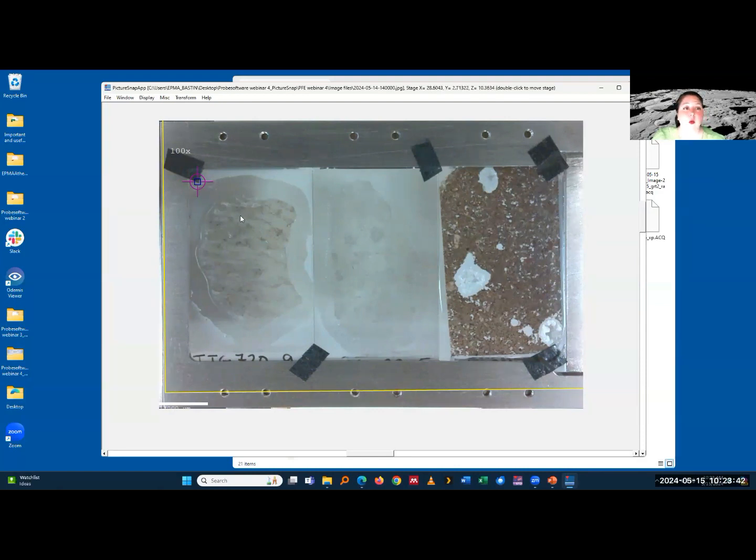You know that you're on the corner of the carbon tape, versus if you use some kind of mineral phase in the image, then there's always the question of was it this spinel or the other spinel. You can get distracted. So that is a very, very useful trick that John Purnell showed me.